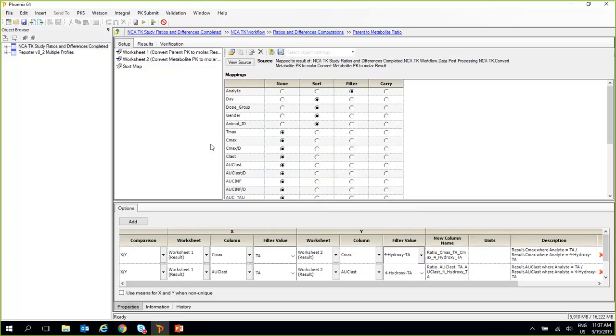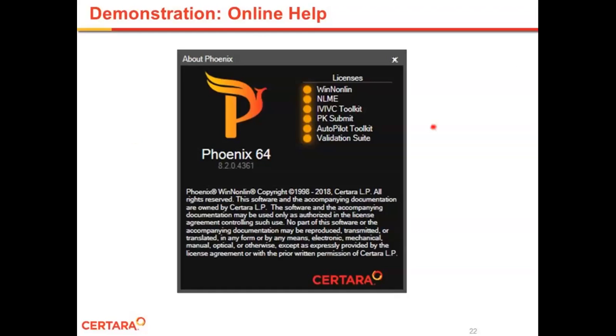All right. So I'm going to go ahead and go back to the webinar and find out if there's any questions about the online help. Doesn't appear to be any questions about the online help. Actually, hold on. Yeah, I think we're good, Chris. Great, great. Thanks, Suzanne. So I'll go ahead and move on to a few other topics here.